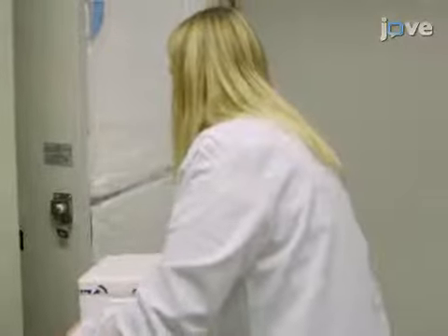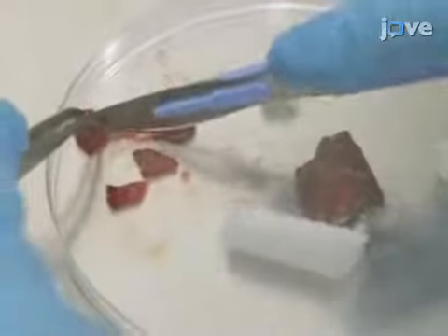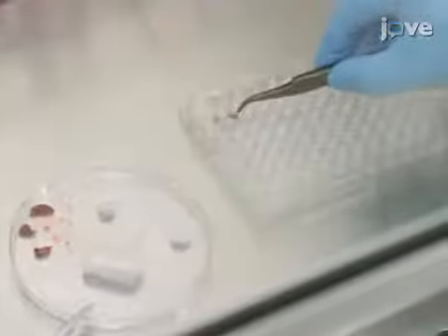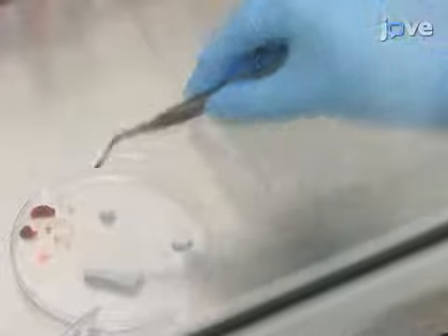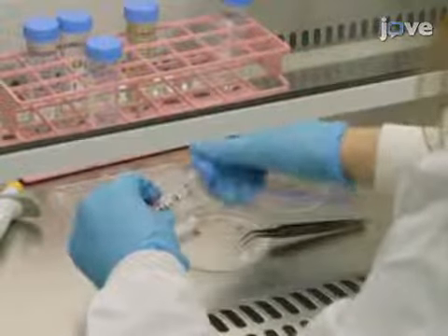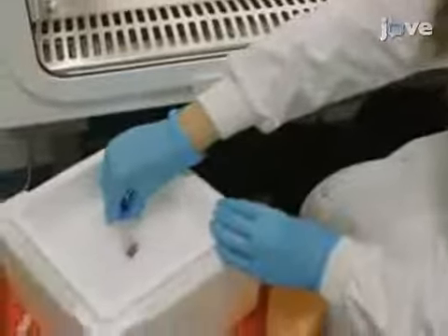Immediately before imaging, remove the human lung tissue sample from the freezer on dry ice. At room temperature, allow the tissue to thaw slightly so that it can be sliced with a scalpel into 1 by 4 mm sections. Using forceps, place the sliced human lung tissue into wells of a 96-well clear flat-bottom tissue culture plate. Return any unused human lung tissue immediately to the storage container and place on dry ice for transport back to the -80°C freezer.